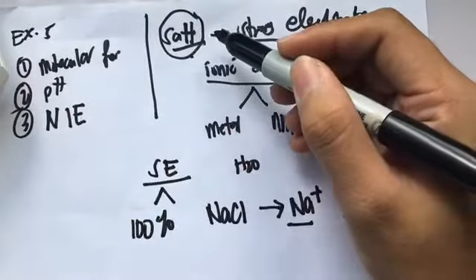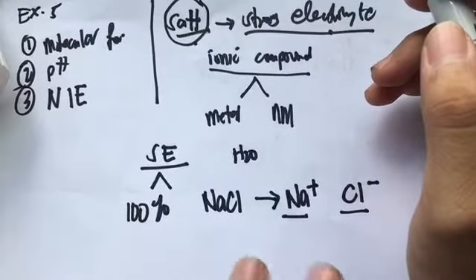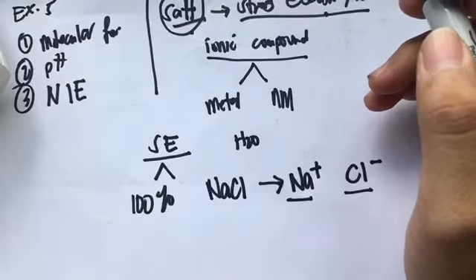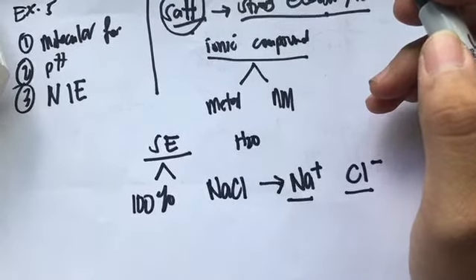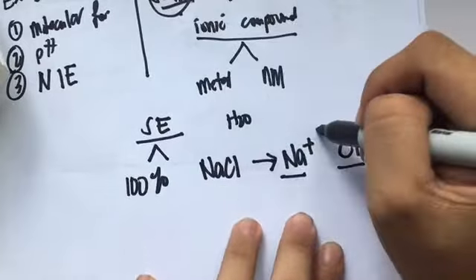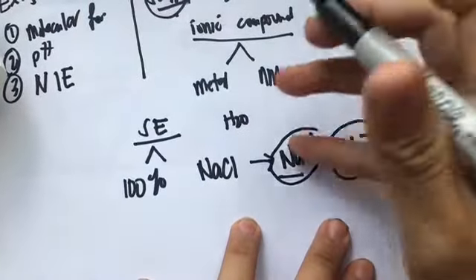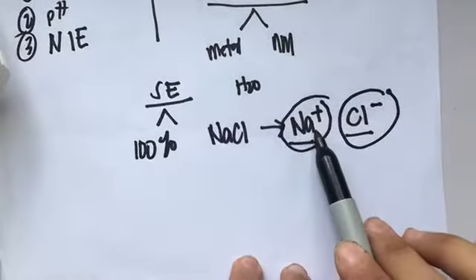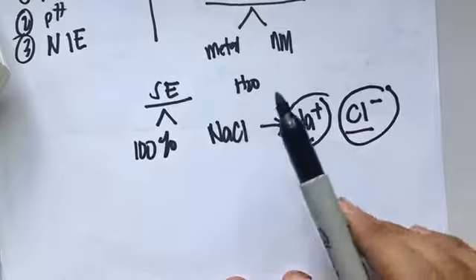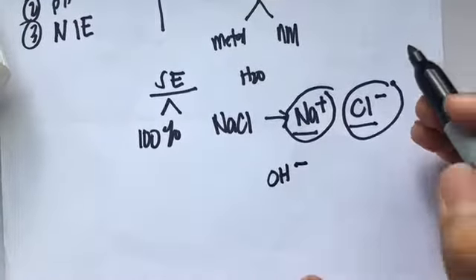Okay. So a salt in an aqueous solution can be identified whether it is acidic, basic, or neutral depending on the interactions of these ions in the water. For example, if the ion reacts with water and forms hydroxide, then the solution is basic.